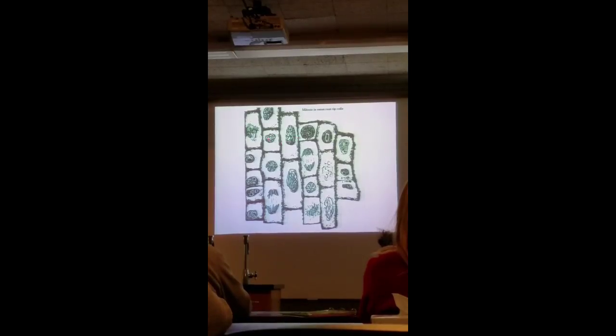Okay, how about this one? Prophase, because the chromosomes are condensing, we can make them out, as opposed to this one where we can't really make out the chromosomes. This would be interphase. This one would also be prophase. The chromosomes are condensing, and the nuclear envelope is breaking down through these little gaps right here. How about this one? Also prophase, just further along, so early, middle, later in prophase.